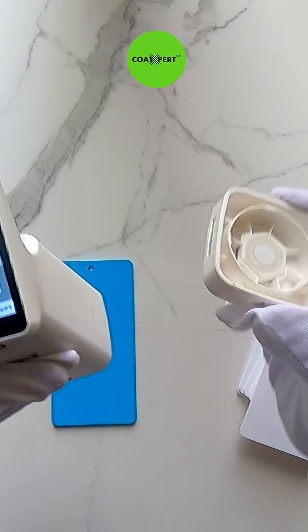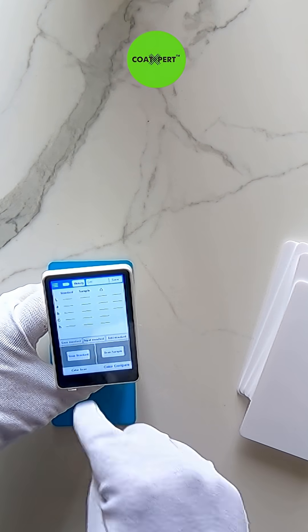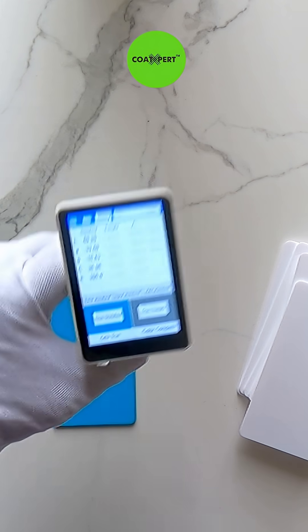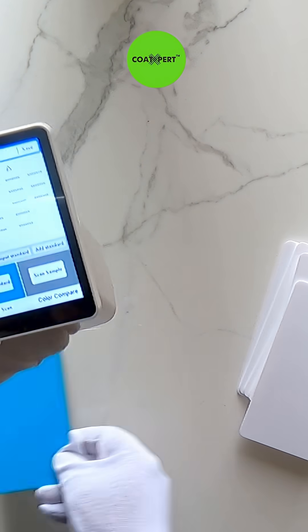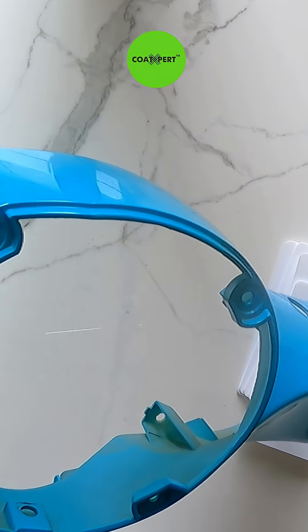So after the calibration, I will place the meter on top of the panel. I took the reading and made it a standard color. With this, I will now check whether the same color is matching on the part or not.